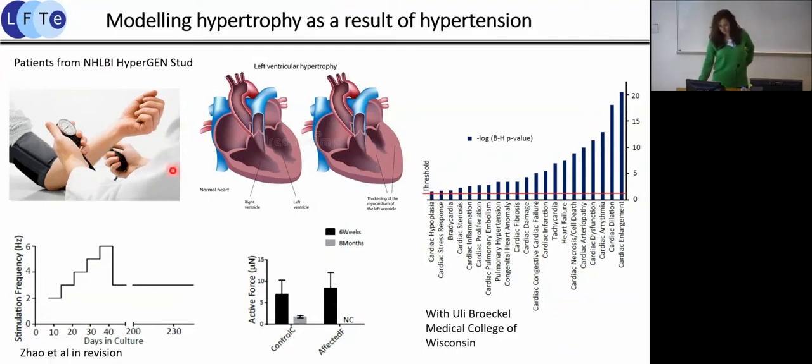And at the end of this protocol, you can see that the control patient's tissues were still able to beat, but in the affected patient, slowly we see a decrease of contraction and twitching, and at the end, there is basically no contraction in these heart tissues, but we can see through live-dead staining that the cells are indeed alive.